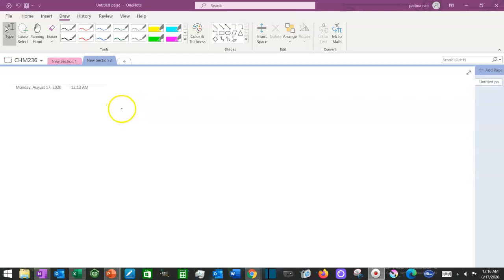Hello, this is chapter 13, Introduction to NMR Spectroscopy. I will use this whiteboard here to introduce some concepts of NMR spectroscopy, and we will divide it into a couple of videos. In this one, we are just going to talk about what NMR spectroscopy is.